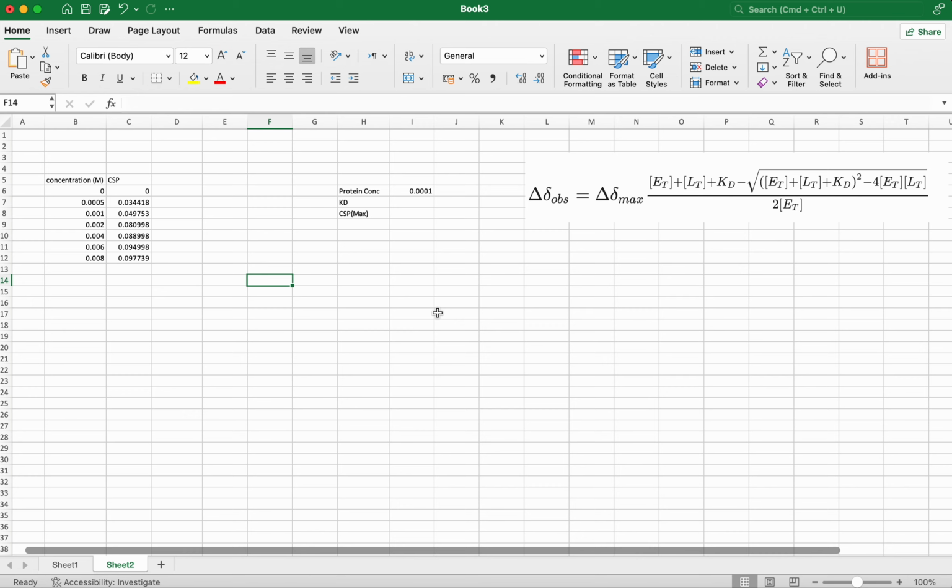In this case, NMR will be calculating for the particular residues. If we are considering a protein, each residue can be fitted differently, with a different KD. And if you are using 1D NMR, like for small simple molecules, there also you can use a particular well-resolved peak to fit the KD.